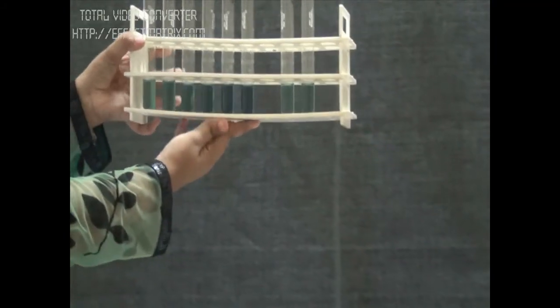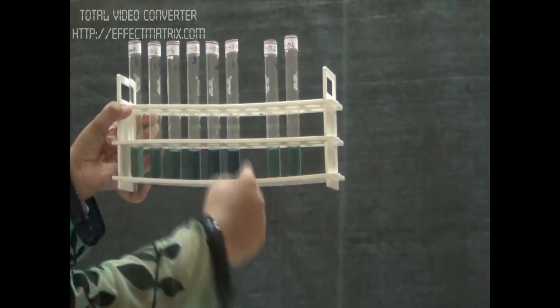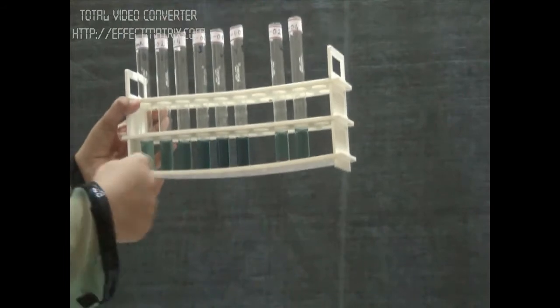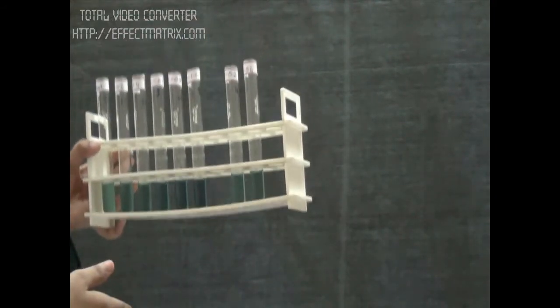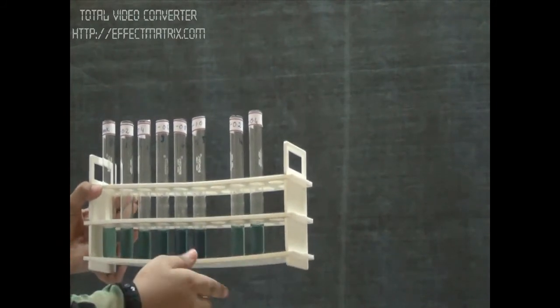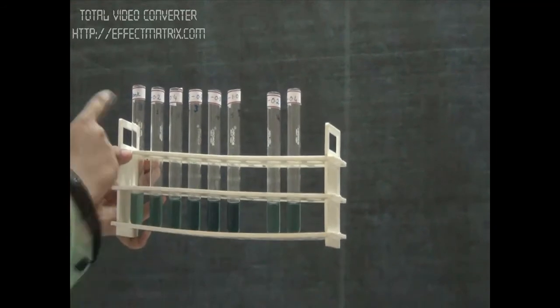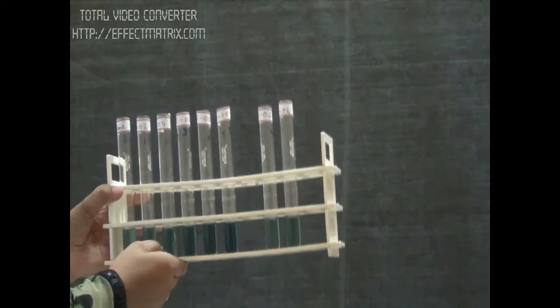So we can see after adding the arsenomolybdate reagent, we got this color. We can see that from blank to our standard 1 ml, the color intensity is increasing as we have increased the concentration of the reducing sugar. Now we take the reading of all these tubes at 620 nanometers, and by plotting the graph of standards, we can calculate the concentration of unknown solution of the reducing sugar.